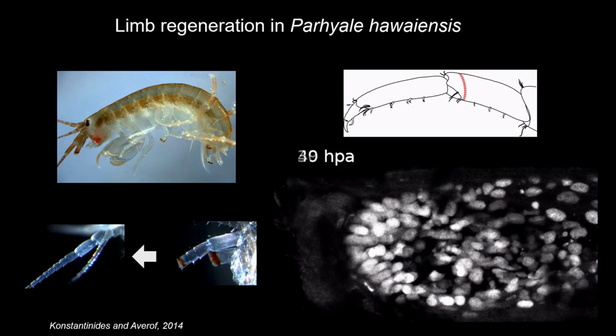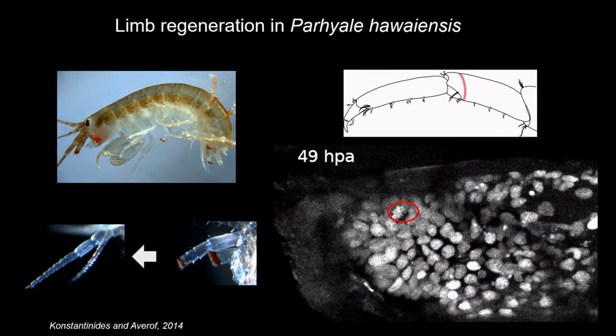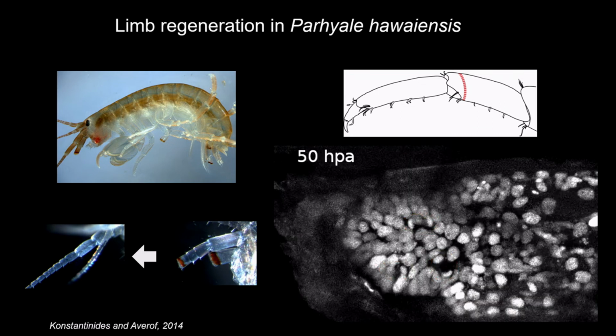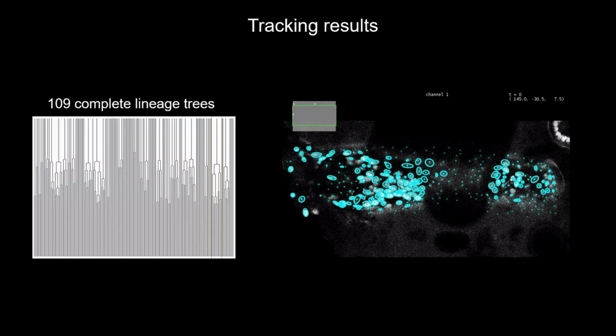This was established by our colleagues, but the image quality is still limited. The signal to noise ratio is not so good, and there are a lot of proliferation events, as shown here. So I would say that this is a challenging data set for image analysis.